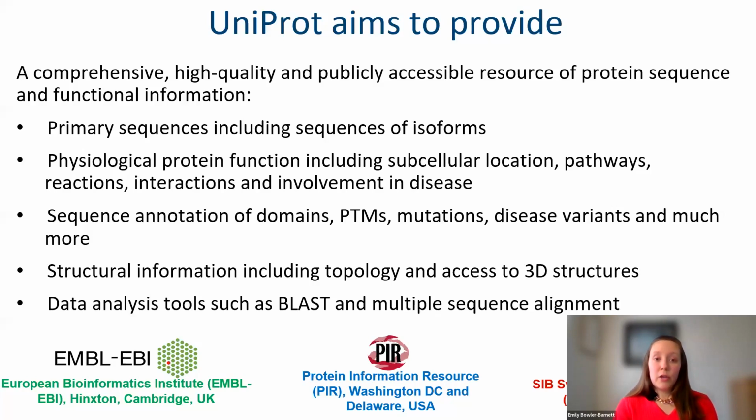UniProt is brought to you by the UniProt team, who I'll have a slide on all their names later. But we're spread across 3 sites around the world, at EMBL-EBI in Cambridge, UK, at PIR in the USA, and at SIB in Switzerland.